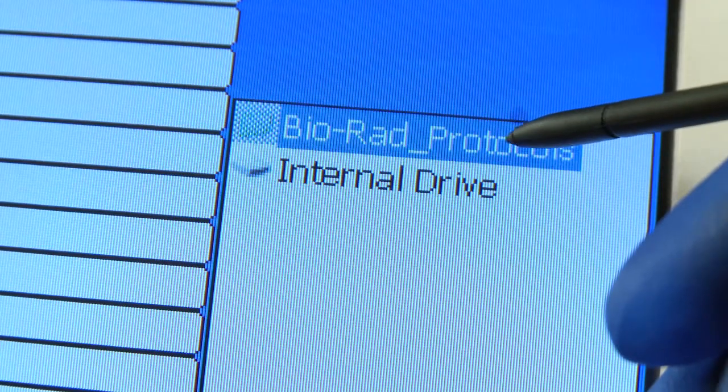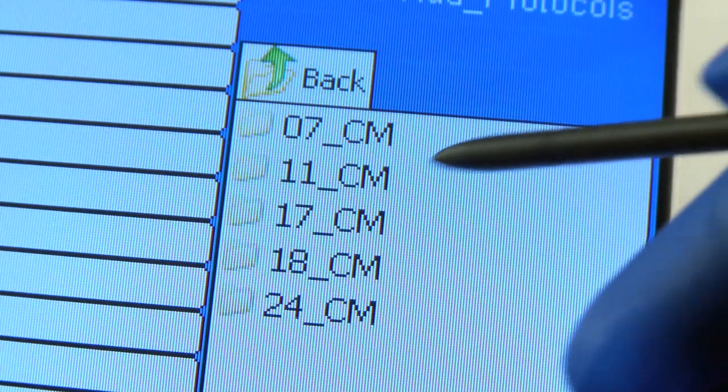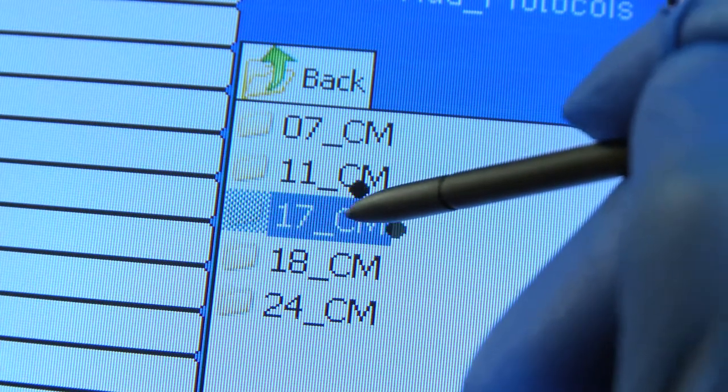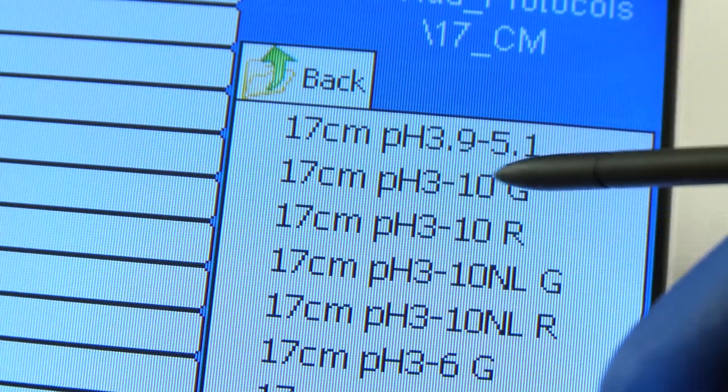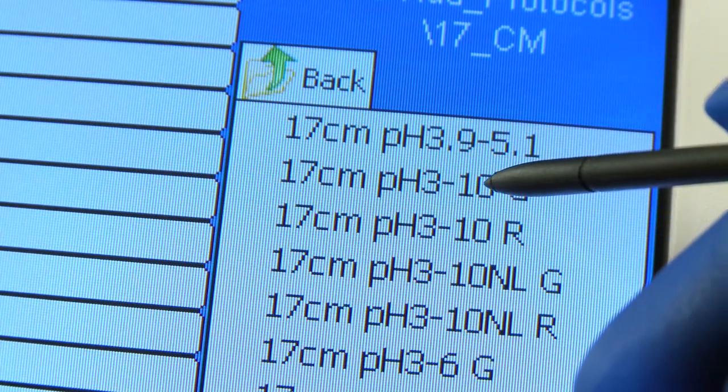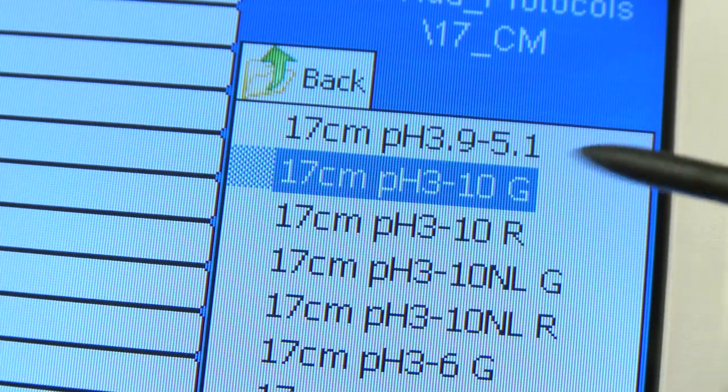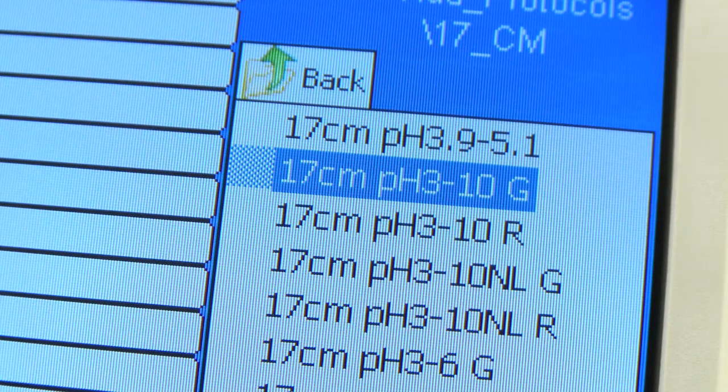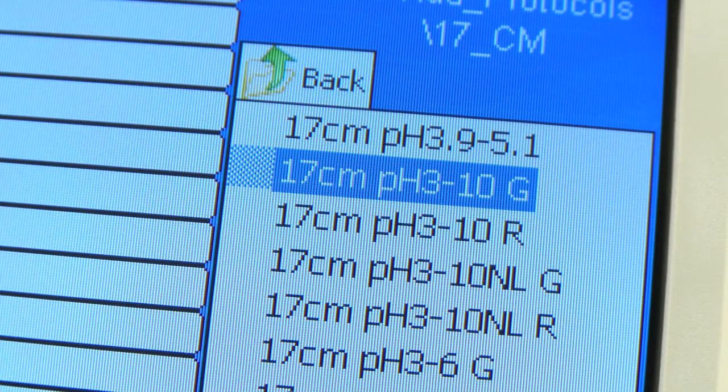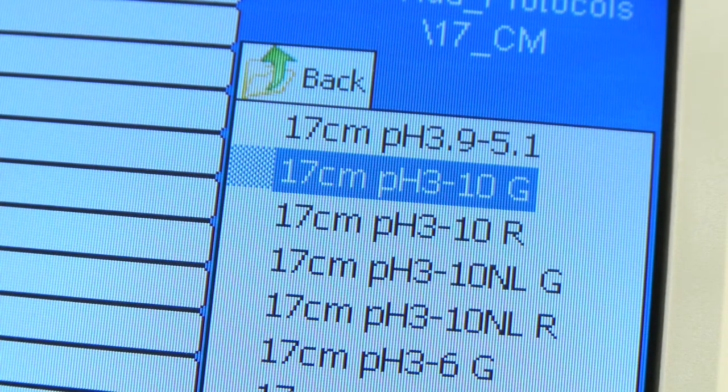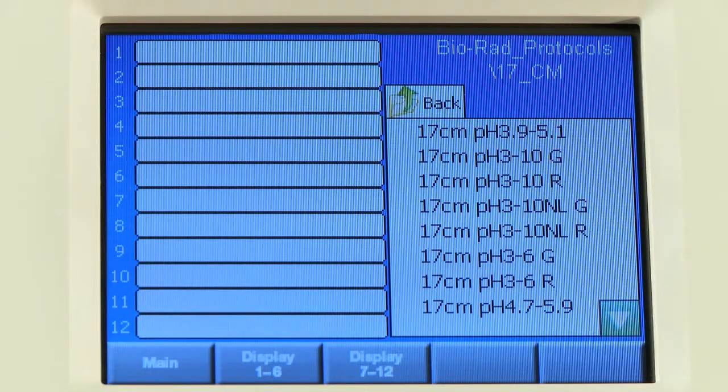Choose the location of the protocols you would like to run. The green folder contains BioRad protocols for all ReadyStrip IPG strip lengths and pH gradients. Alternatively, you can choose protocols that you have created and stored.